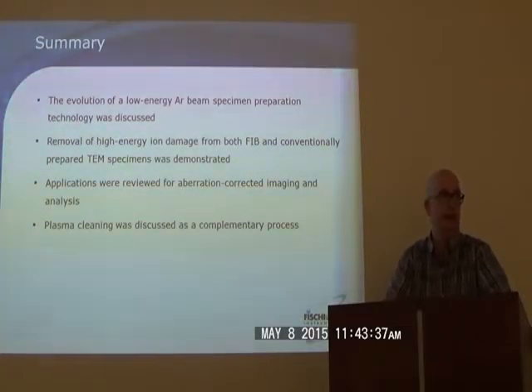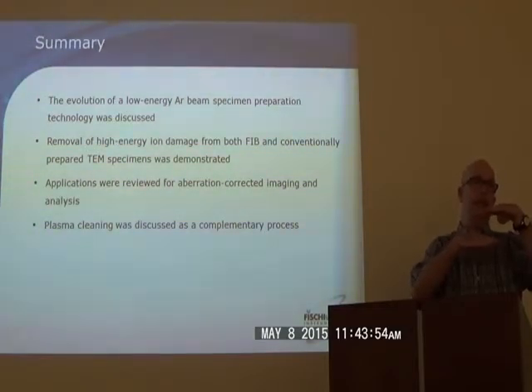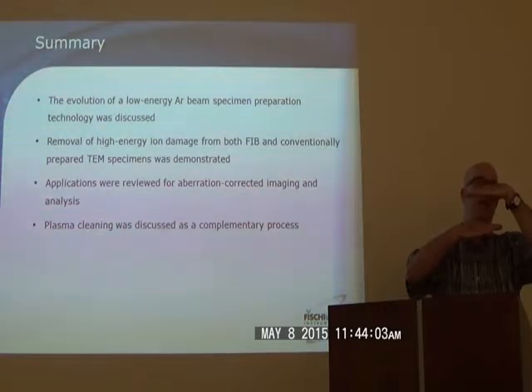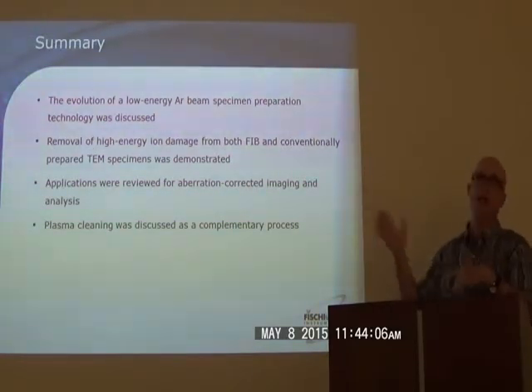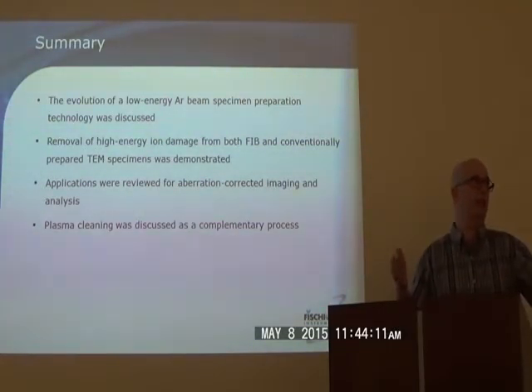And also you have the STEM detector, with which you can see how thin the sample is, which NanoMill doesn't have. That's true. The idea with the Pico is we have a way to detect, as in a TEM, a STEM detector underneath the sample position. In the NanoMill we only have an ion source and an ion column, and then we have a secondary electron detector that creates an image.